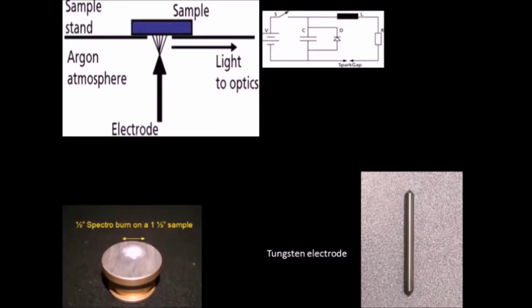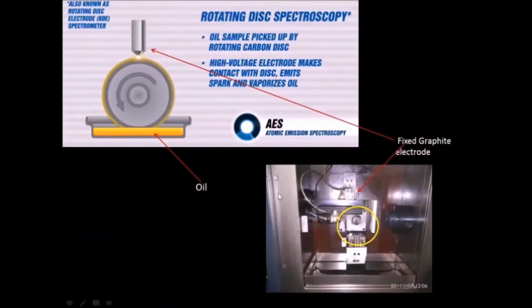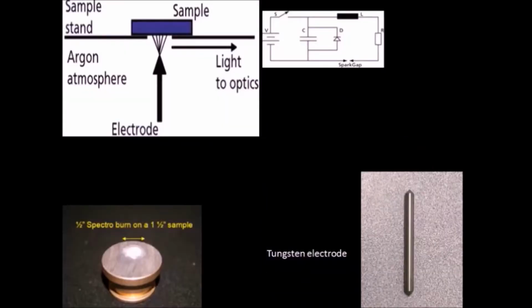The arc or spark from the source is shielded in an inert argon atmosphere created with argon grade 5 having purity 99.9998 for equipment used for testing metals, while no such provision is required in the case of oil spectrometers. Because in the case of metals, impurities such as carbon and oxygen present in the atmosphere may affect the readings, while during testing of lube oil, the lube oil medium itself inhibits any contamination from the atmosphere.